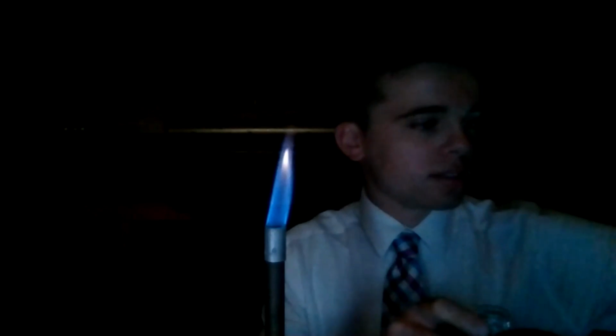Are your minds blown yet? Are you like, holy cow, Mr. C? This is the most exciting class of the day. No one else burns things and catches them on fire. No. Do other teachers catch things on fire too? Am I not the first one to do this for you? Do you catch something on fire in language arts? Let's see. Let's do strontium next. That's a cool one.